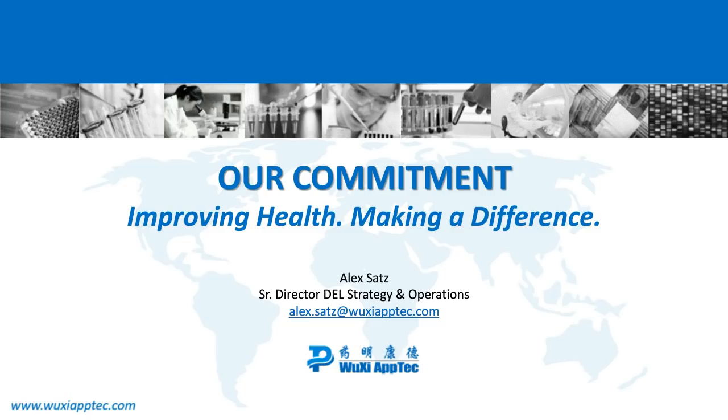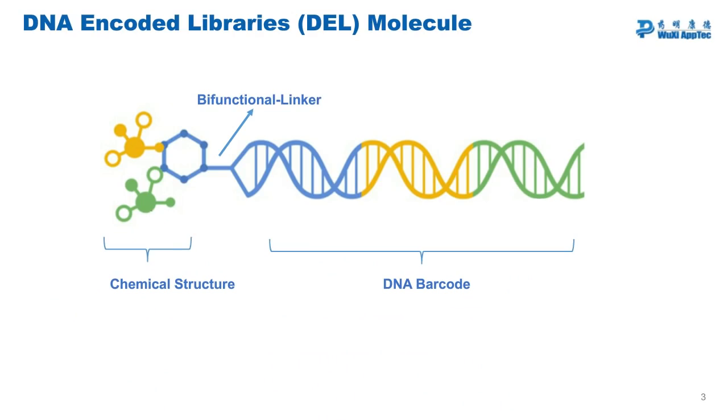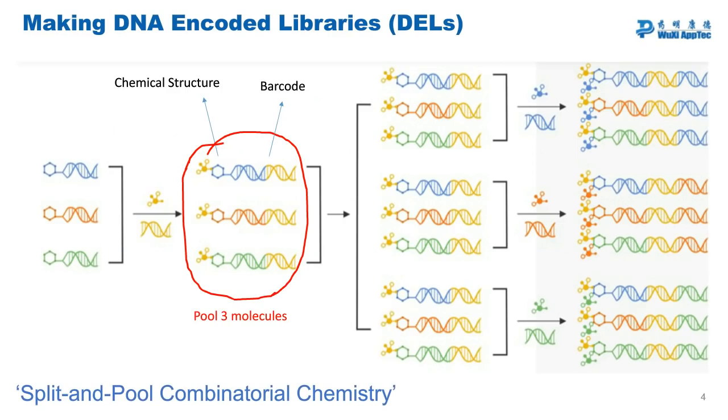Let's start off with a question here that asks: you talked about how broad a chemical space the DEL compounds cover. Do the compounds still adhere to Lipinski's rules, or is this a broader battery?